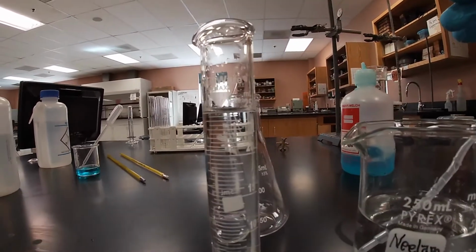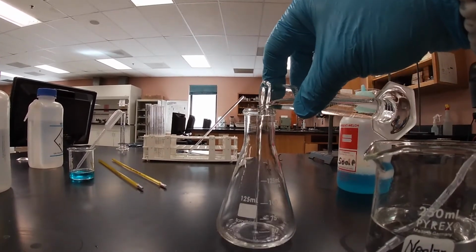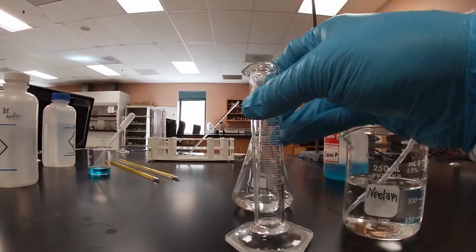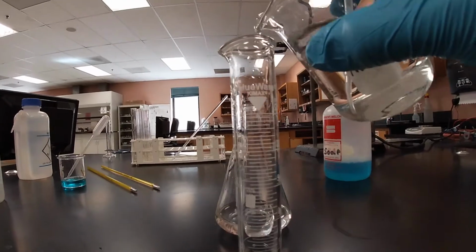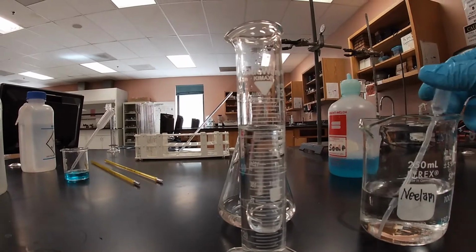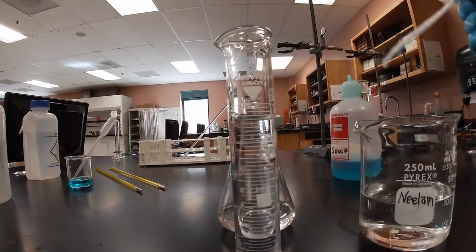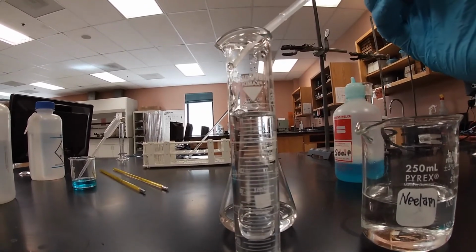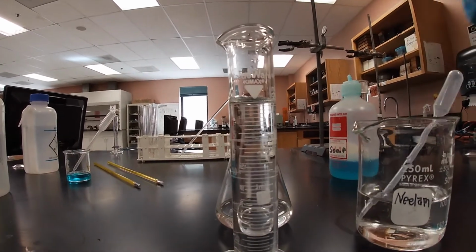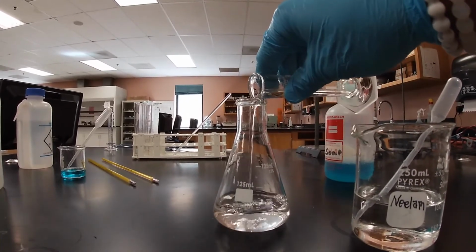And we're good to go right there. That's our 25 milliliter mark. We'll transfer to our Erlenmeyer flask, the other container. We'll again get some more out. We need about 25. So we'll get close and then we'll pipette the rest of the way so that we don't go past it. And we're good to go. 25 milliliters, so a total of 50 milliliters of our tap water.